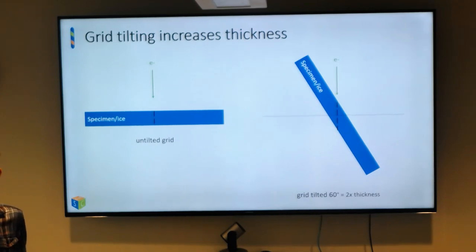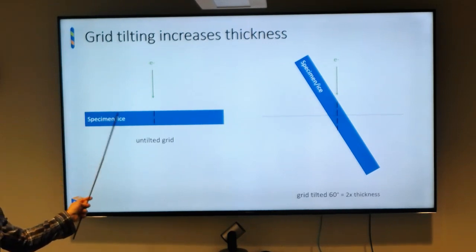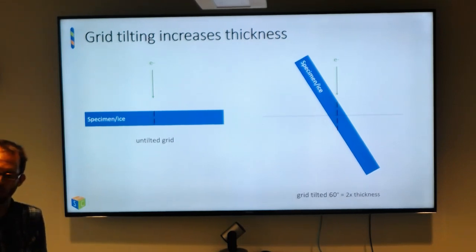I'm going to do the high angles last. So that's the main reason. Does that make sense? So you want to go through less ice and get the most signal that you can out of your best electrons. So you go back and forth and back and forth. That's the best collection scheme, though it can be slower and less accurate depending on what software you use.